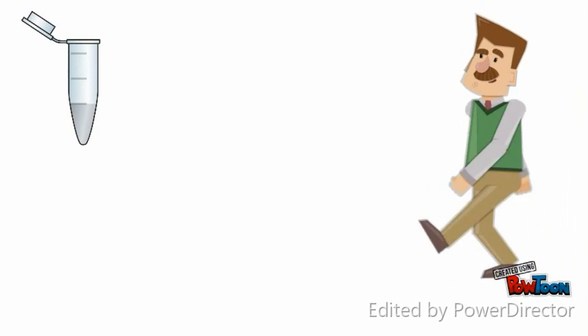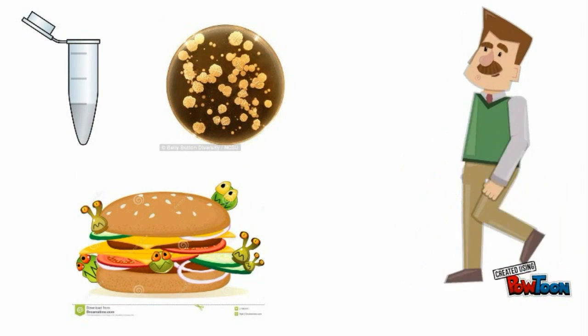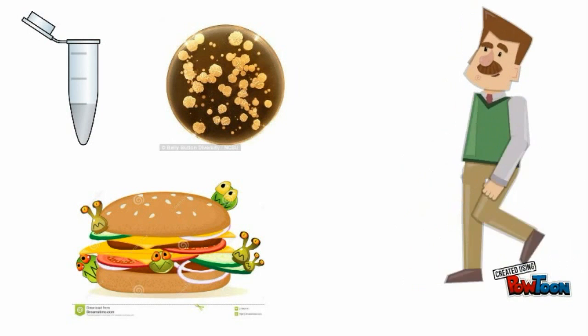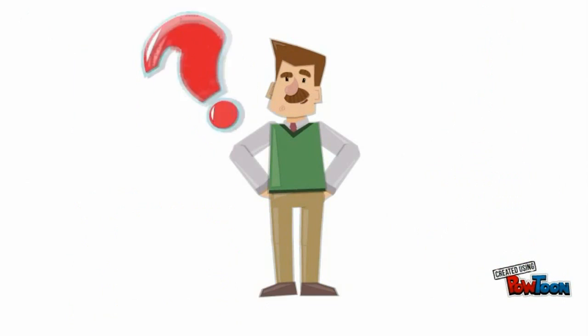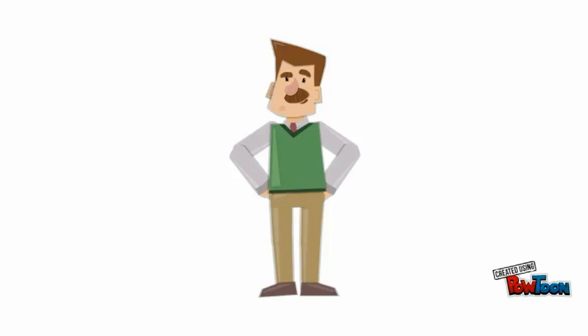From a culture tube, an environmental sample, down to a contaminated food, bacteria are present. They are invisible to the naked eye, yet they influence every environment on Earth. What happens when you need to know how many individual bacterial cells are thriving in a certain environment? You need some method for counting the bacteria accurately.